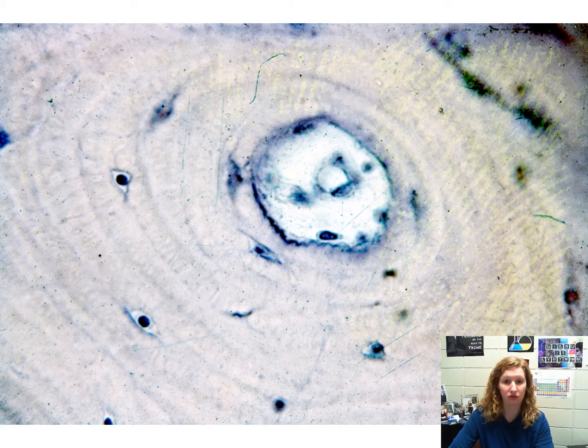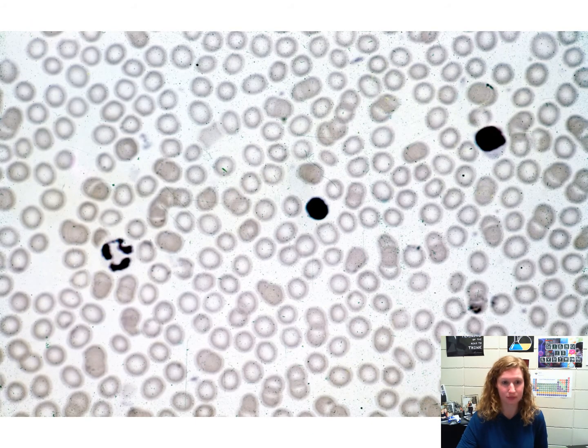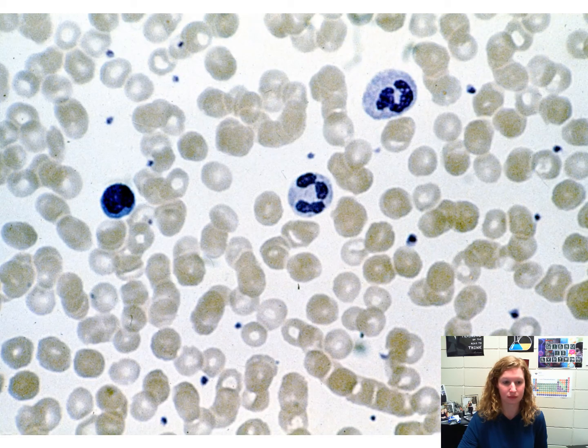Make sure on one of these slides that you are able to identify those components of the osteon. Blood. And be sure you can pick out the red blood cells or erythrocytes, the white blood cells, the leukocytes, the platelets, and the plasma matrix.